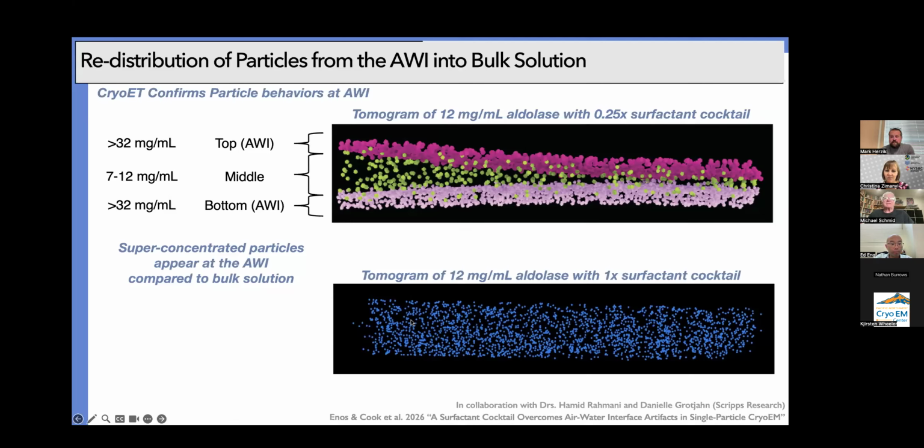I've been looking at images of it for over a decade now, and it doesn't present as obviously denatured because you get different views where you can see it's obviously intact. But the problem is that usually what's denatured or destabilized is looking dead at you through Z, and so you're being projected through the rest of the molecule. You don't typically see it until you start to reconstruct it fully in 3D.